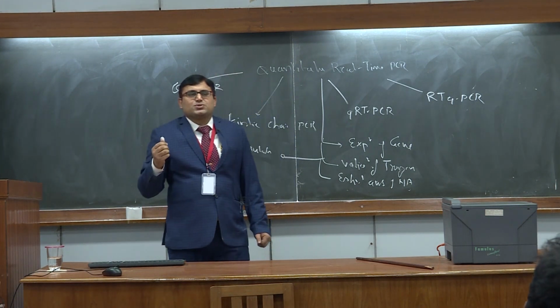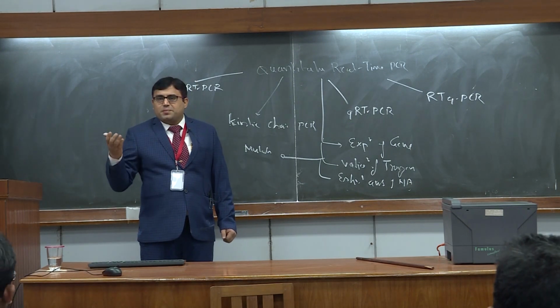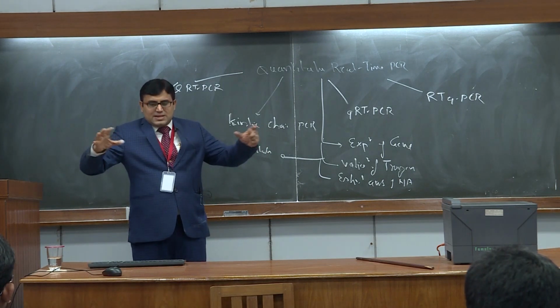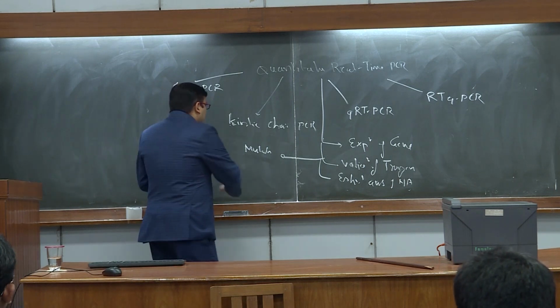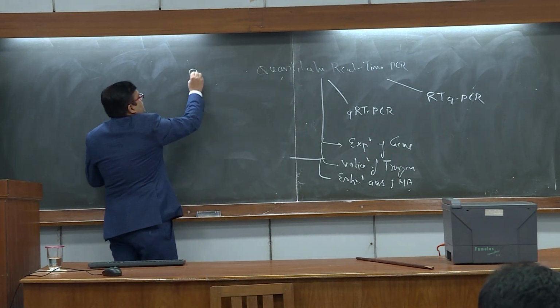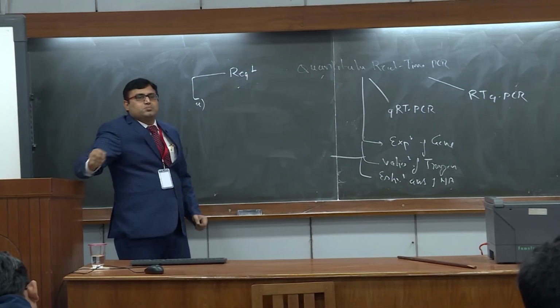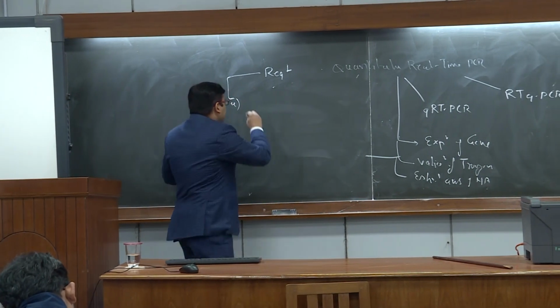Now, the next question is, if I wish to use this technique, what are the requirements? What are the things you require so that you can assemble all of them and go for real-time PCR? First and foremost is the platform, the machine which you are going to use. This is called the platform.